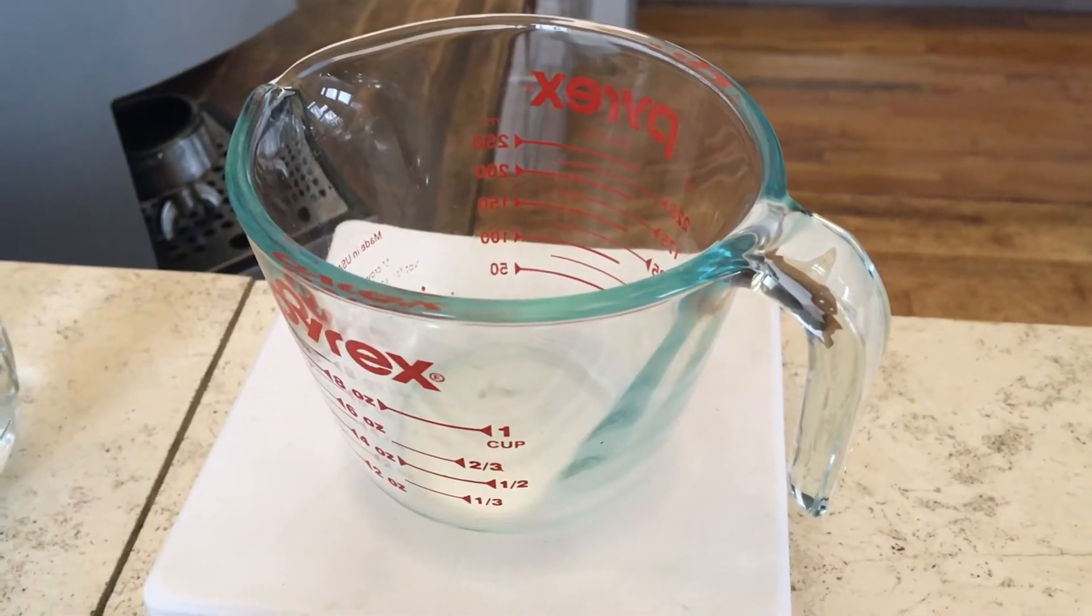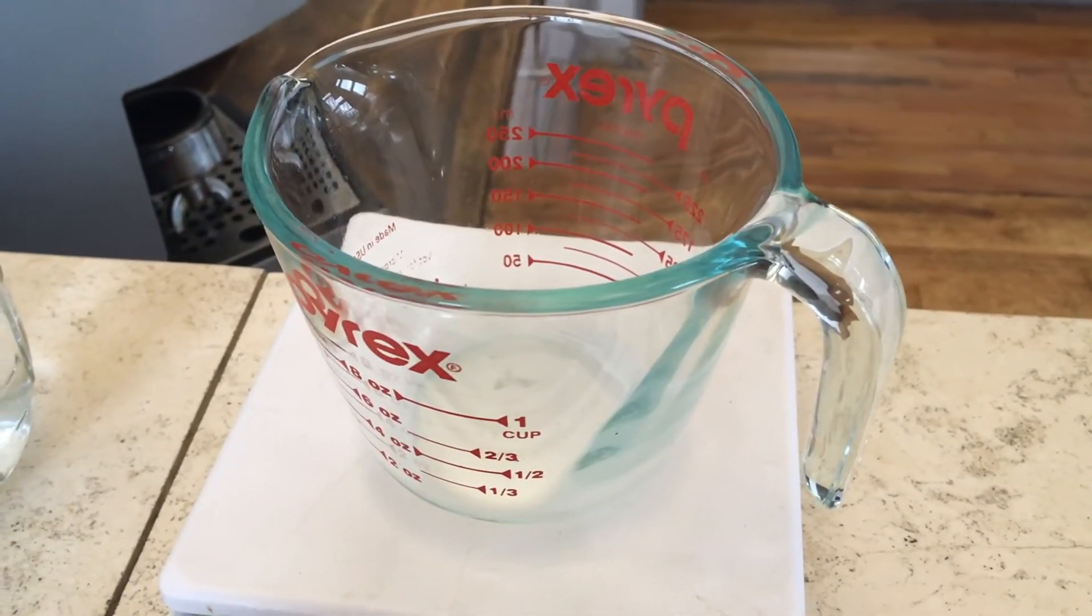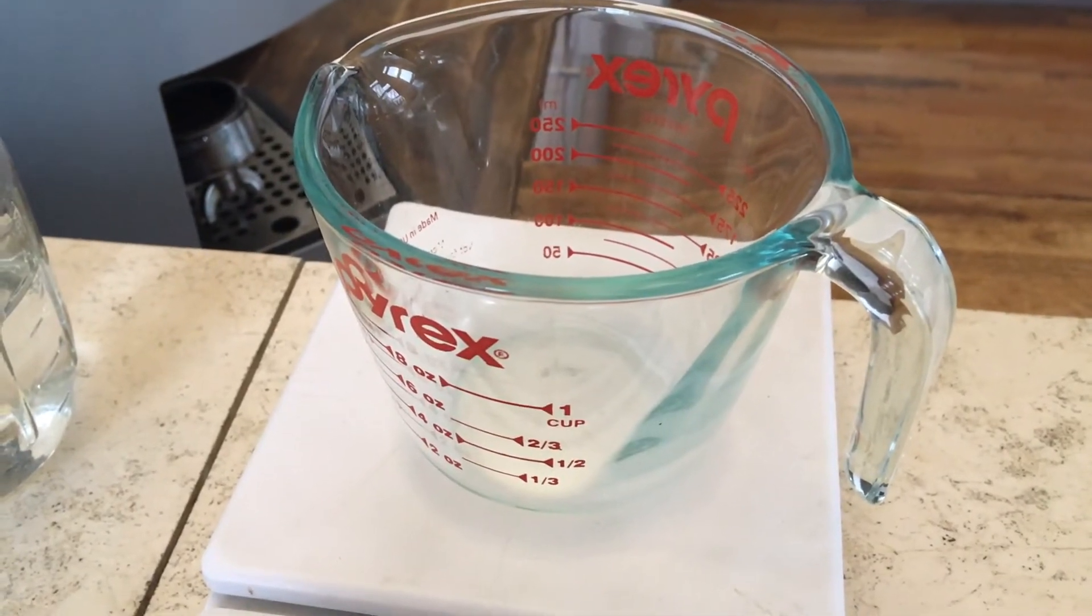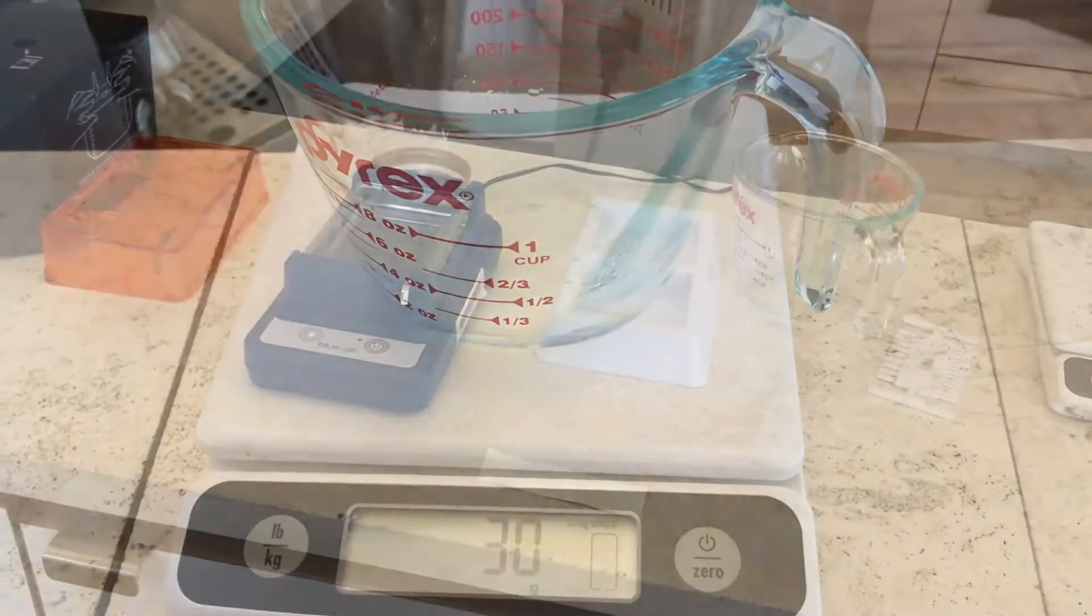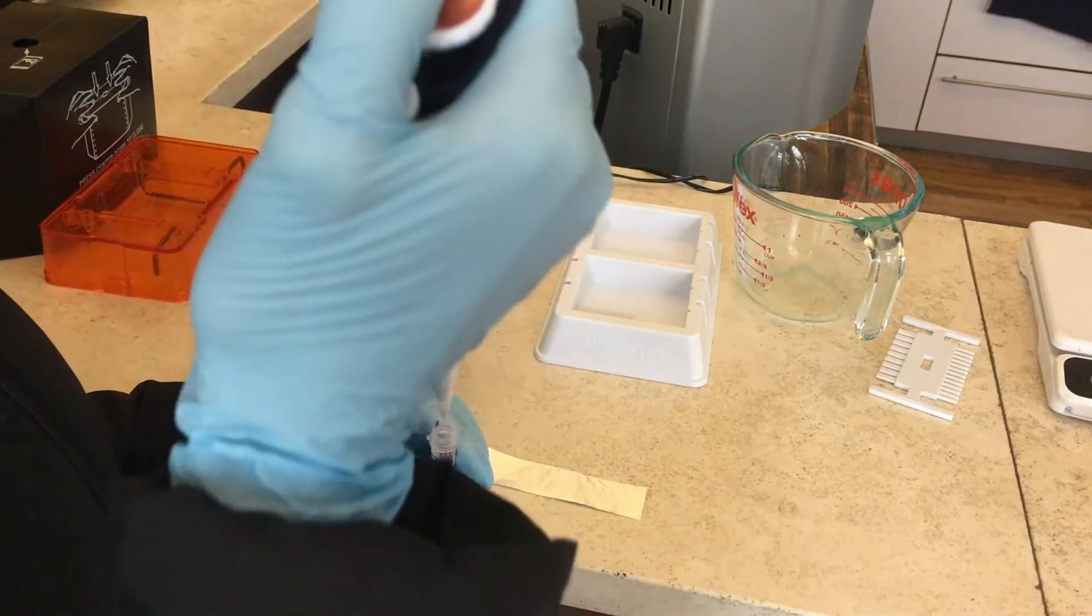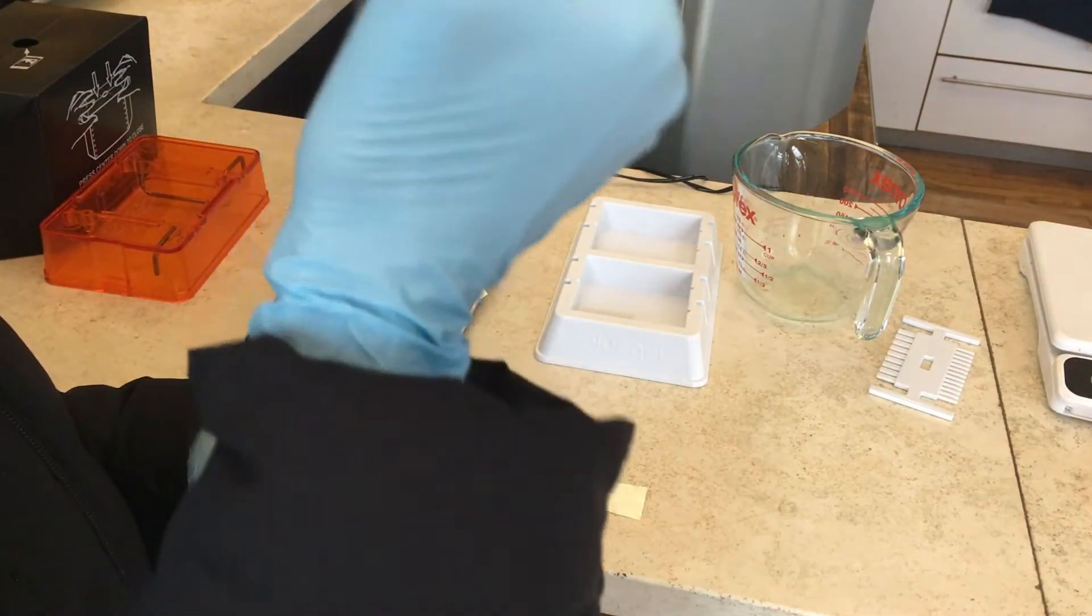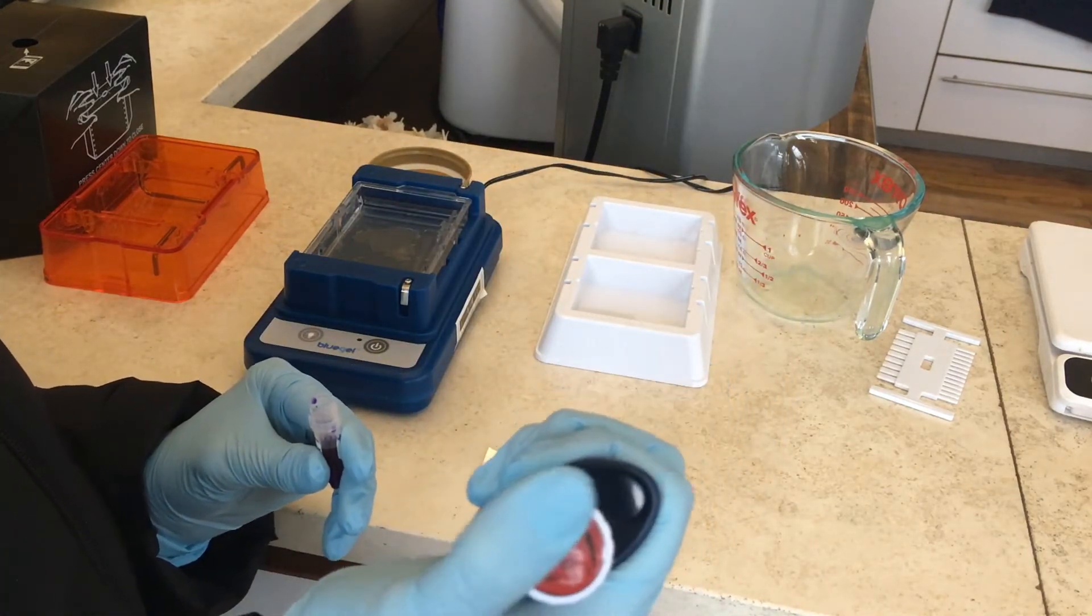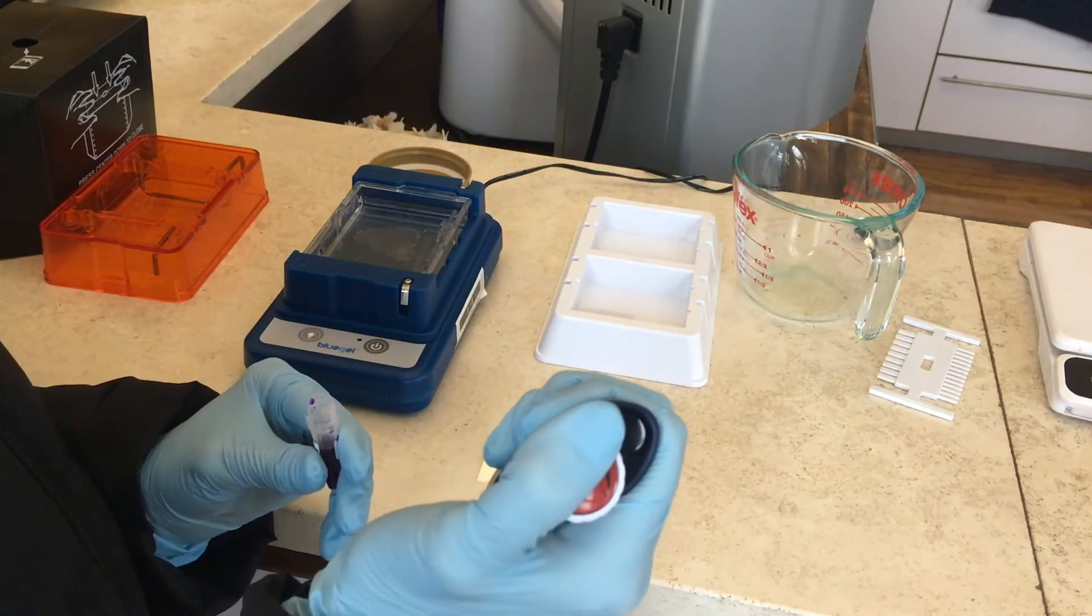We're going to have to put about 30 milliliters of the TBE buffer into the glass jar because that's what we're going to pour over the gel. And then what we're going to have to do is put eight drops of the loading dye onto a strip of aluminum, about three microliters per dot. So I'm going to just do them one by one.